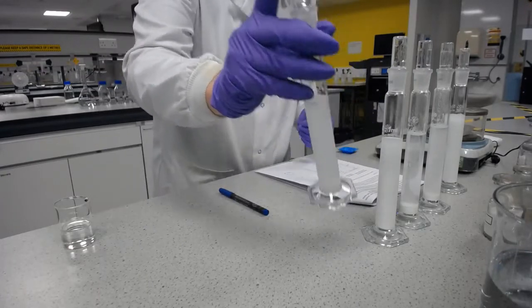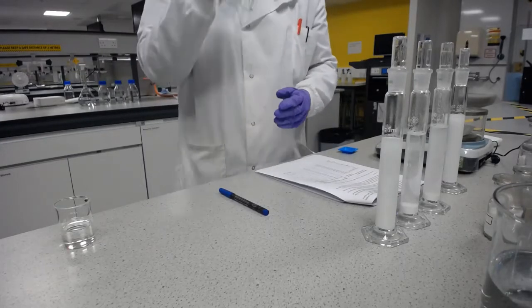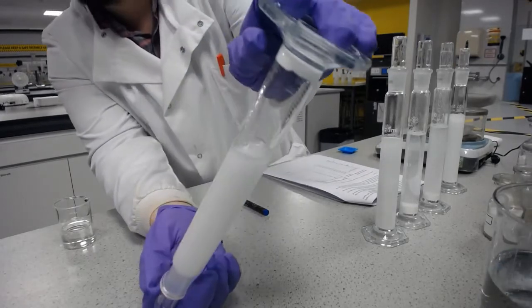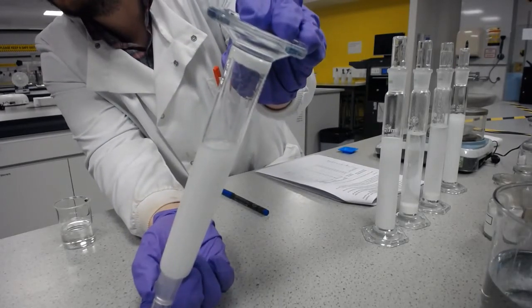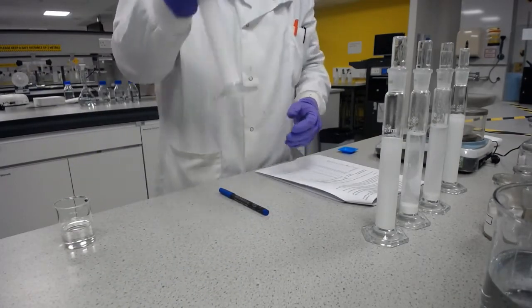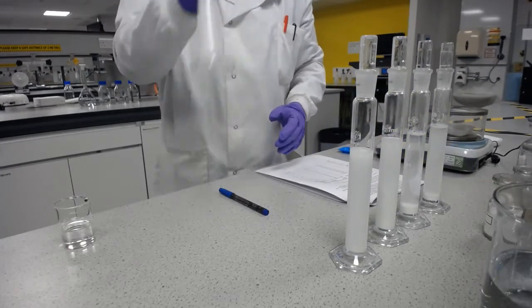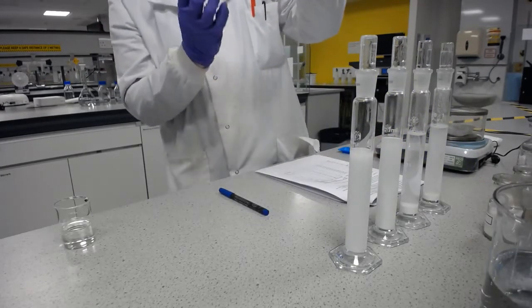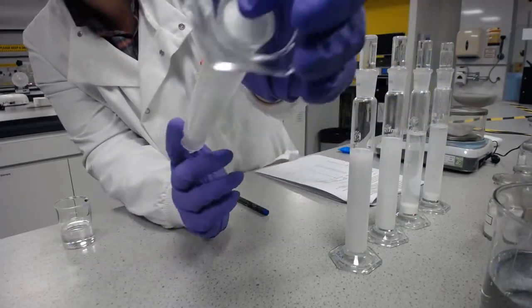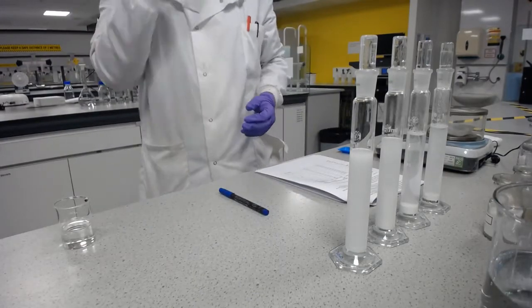And indeed, let's see if we can, even with shaking, just get this one in. You can see there we've still got the cake at the bottom, so I'm going to enjoy trying to wash that out later. Nope, not budging. And how about with just water? Let's give it a good shake. Nope, you can still see we've still got the powder right at the bottom. In fact, I would say that's worse because it's so compacted.